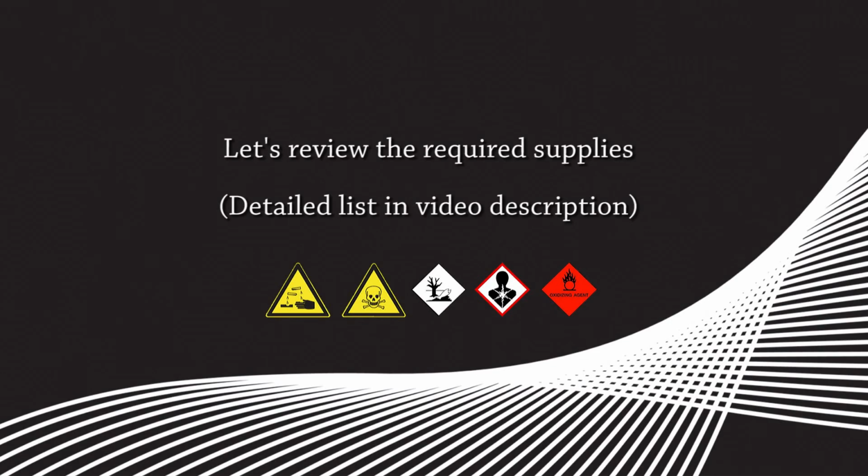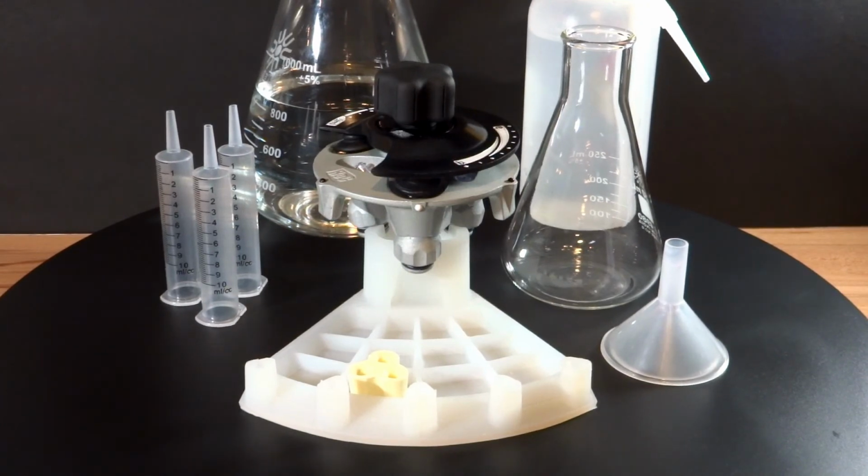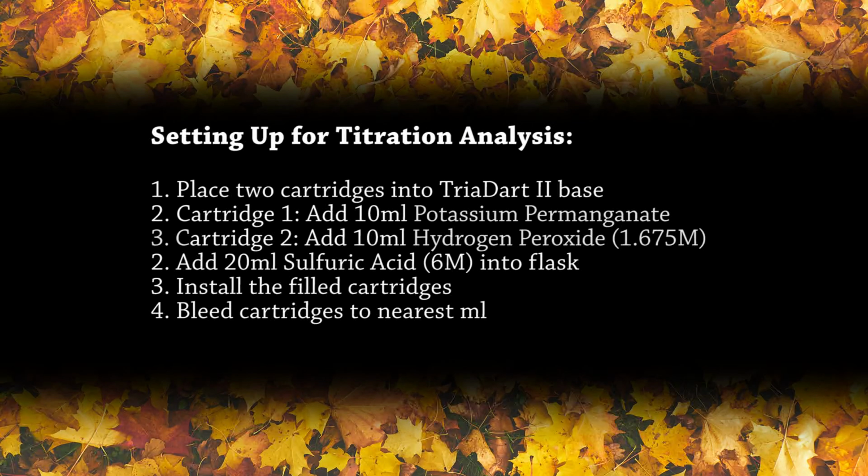Today we'll titrate potassium permanganate with hydrogen peroxide. A novel pipettor will be used to conduct the experiment. We'll go over preparation of materials and labware, then conduct 3 titrations. Once our data is recorded, we will calculate the molarity of potassium permanganate.